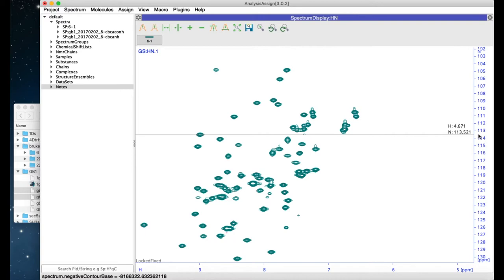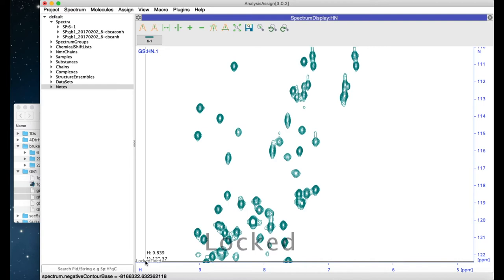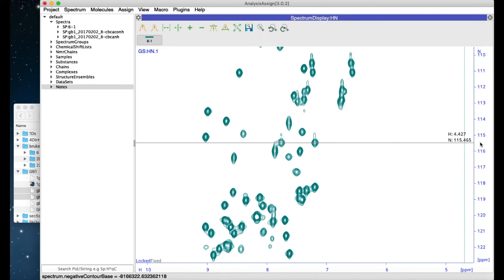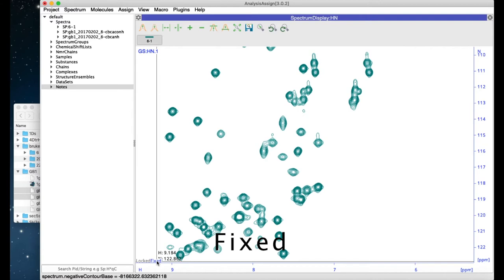Once you have a setting that you'd like, you can lock that aspect ratio by clicking on the locked button in the bottom left-hand corner. Now the aspect ratio will stay locked. Alternatively, click on fixed and then the aspect ratio will go to a preset fixed value.